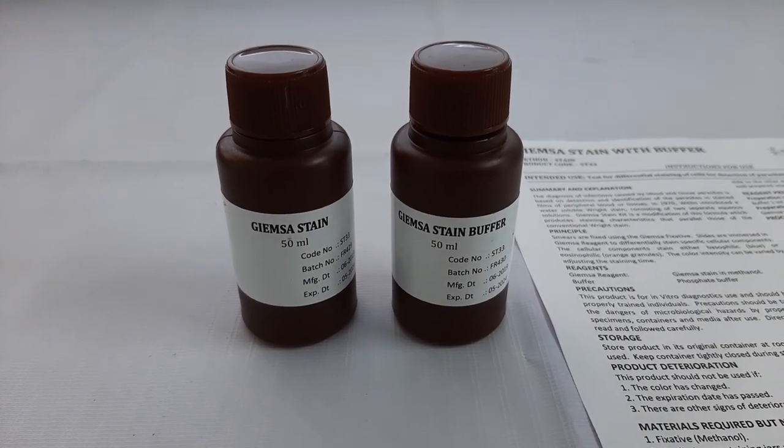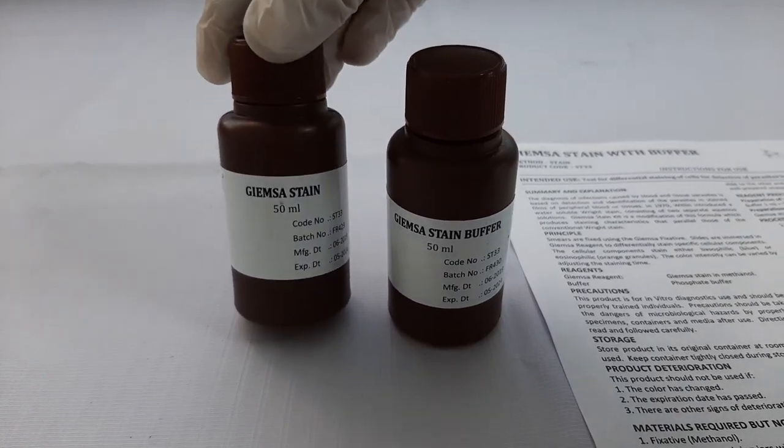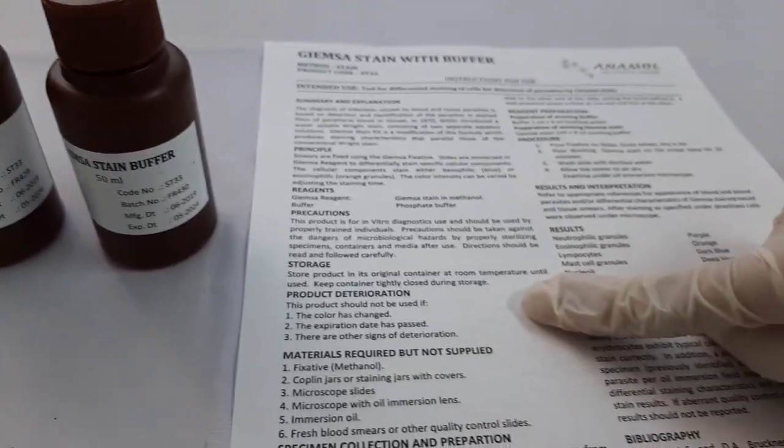First, let's have a look at the kit components. The kit contains one bottle of Giemsa stain, one bottle of Giemsa buffer, and the instructions for use.